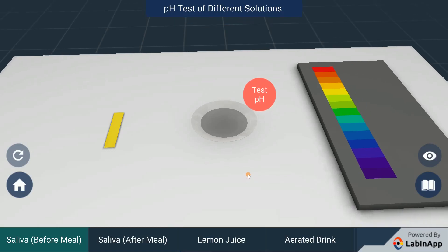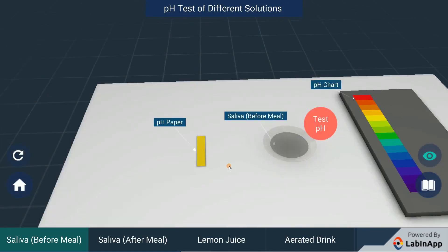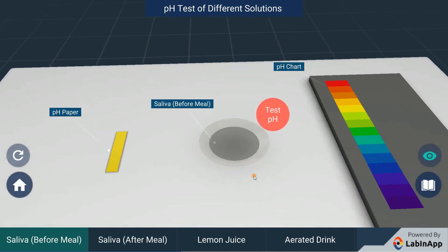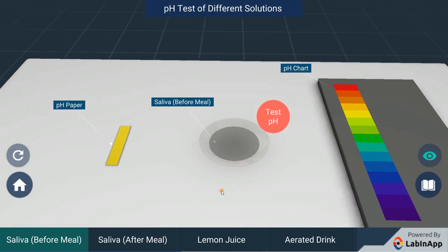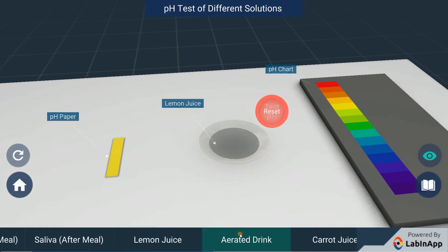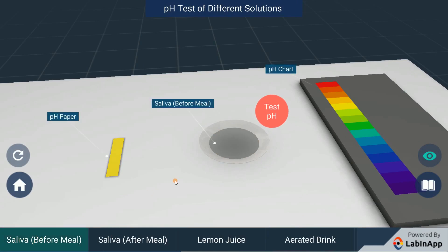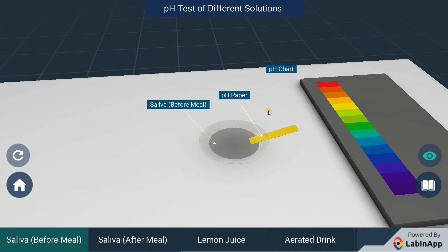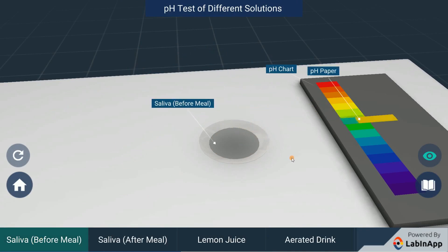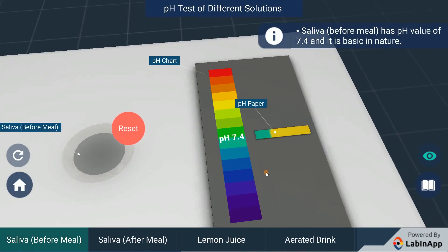Let's study pH of different solutions. For this, we have to take pH paper and different types of solutions. Take a pH paper and dip it in a solution and observe. You will see a change in paper colour and compare that with the pH chart to know the pH value. Do the same for different solutions.